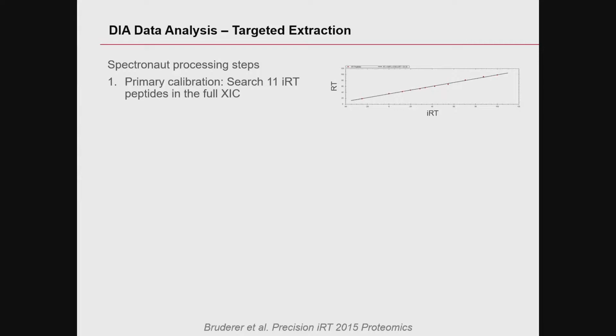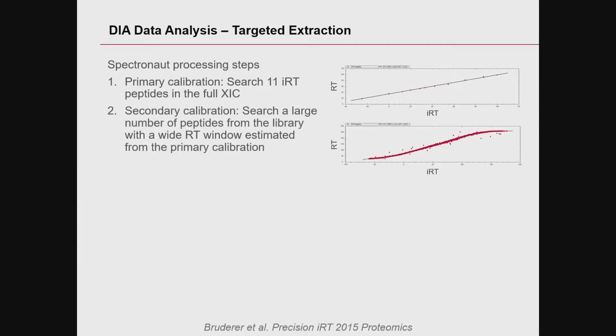And so this is basically what we implemented in the Spectronaut software, and it's described here in a bit more detail. So we have this 3-way of analyzing the data, which was actually initially inspired by MaxQuant because it also has this 2-way of processing the data, first the calibration and then the main analysis. What we do is a 3-step analysis.